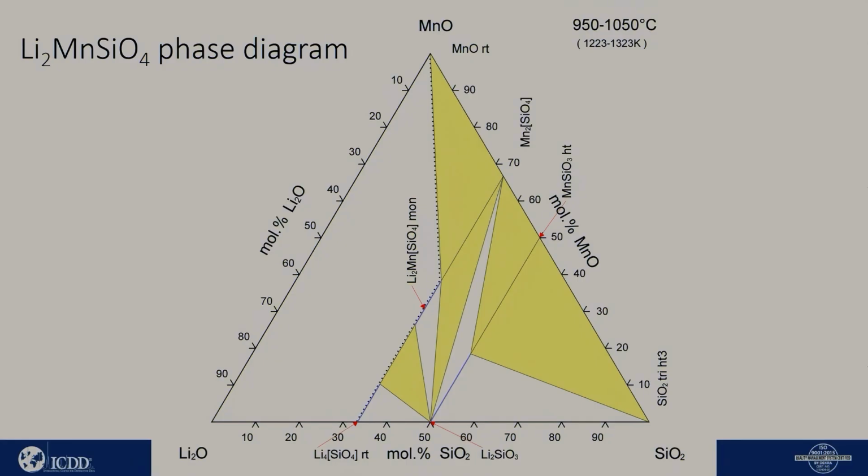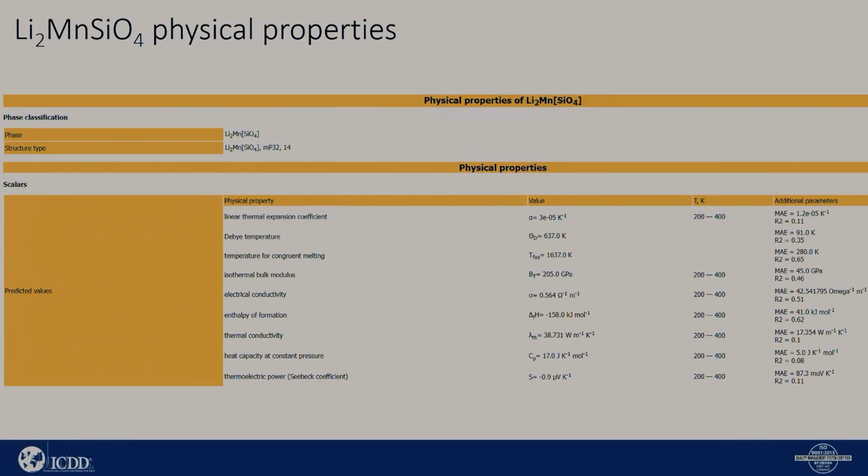And beyond the phase diagram, in this case with this particular type of ternary system, you start to work on things about observed versus theoretical calculated structure properties. And this is what people are doing now, trying to design new materials: taking the structure and trying to say, how can I design new materials faster for certain properties that I'm looking for?